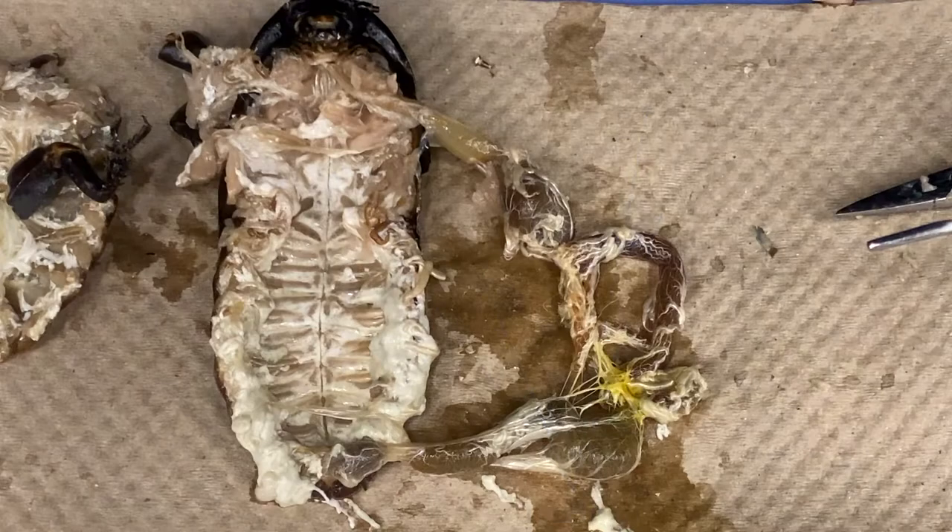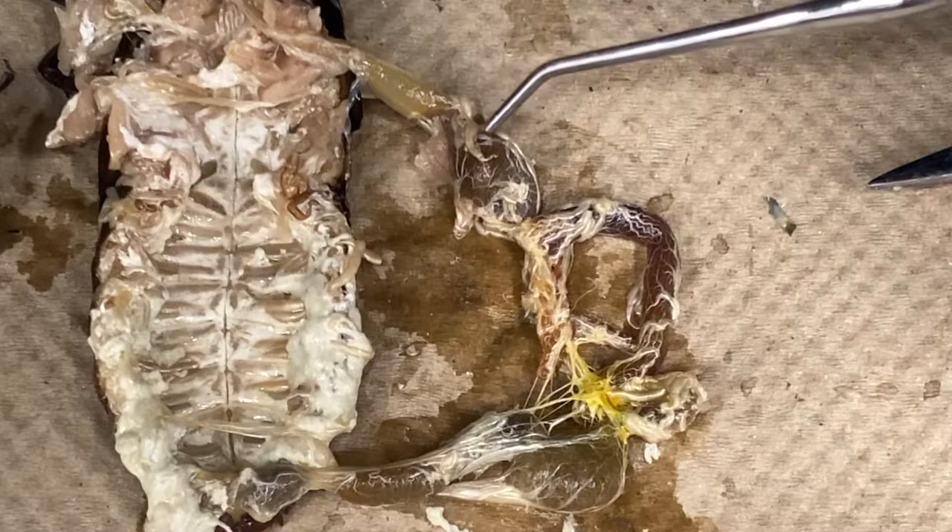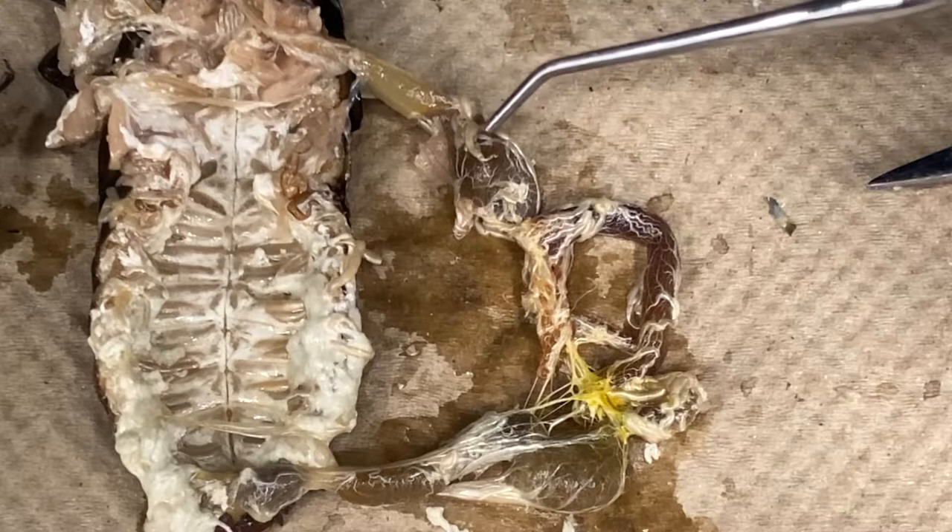Now that the dissection has been completed, you should be able to identify the various parts of the digestive tract. These parts include the esophagus, crop, gastric ceca, malpighian tubules, colon, and rectum. At this point, your dissection is complete, but feel free to continue to examine your specimen and see what else you can identify.